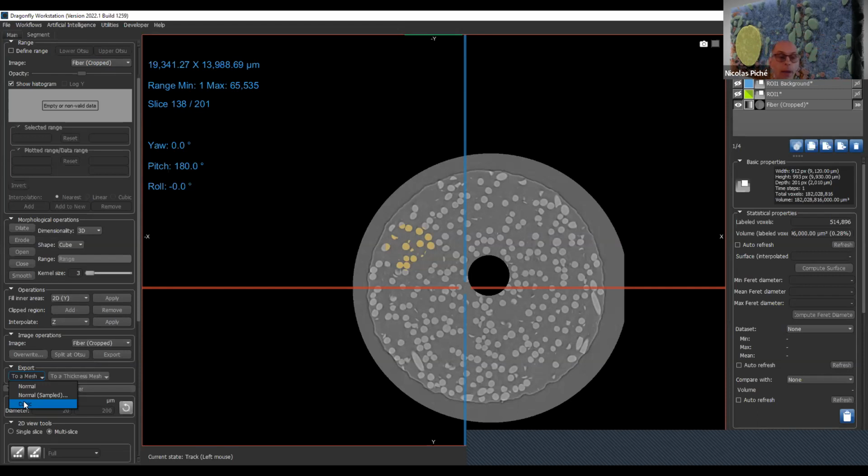By the way, in the next release, we'll have a 3D mesher, a tetrahedral mesher included. In fact, we have included NetGen in the software, so you take a multi-ROI with 4 billion colors, if you wish, and it will export it as a 3D mesh that you will be able to see on screen, controlling the density a bit.